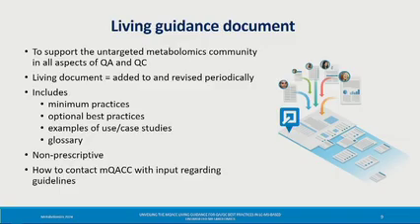So the Living Guidance document is intended to support the Untargeted Metabolomics community in all aspects of QA and QC. And by living document, we mean that we intend to add to it and revise it periodically, both in response to workshops like this, but also individual bits of community feedback, issues people raise, people thinking corrections need making, or that a piece of guidance is outdated. We want to be able to capture all of that, and we'll be able to have the document itself evolve over the course of its life.